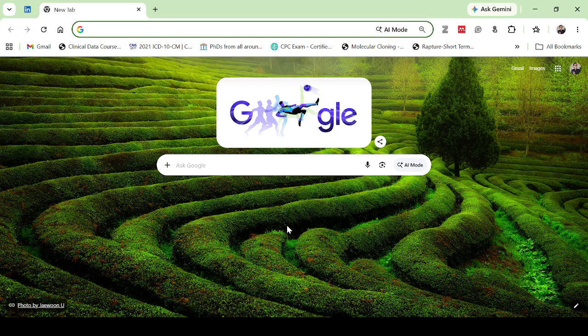So, have you ever wondered where researchers obtain real next generation sequencing data for their bioinformatic projects? Whether you are performing RNA sequencing, metagenomics, whole genome sequencing, or antimicrobial resistance analysis, you need access to raw sequencing data. Fortunately, the NCBI provides one of the world's largest repositories of sequencing datasets completely free of charge. This source is called the Sequence Read Archive, that is SRA. In today's tutorial I will show you exactly how to search, explore, understand and download sequencing datasets from the NCBI SRA database.